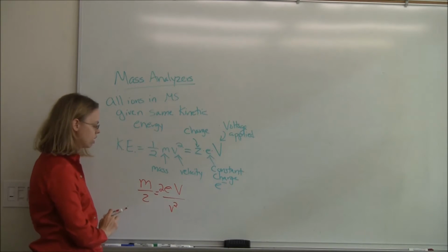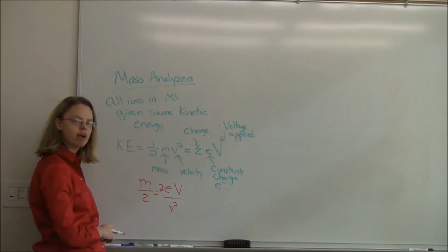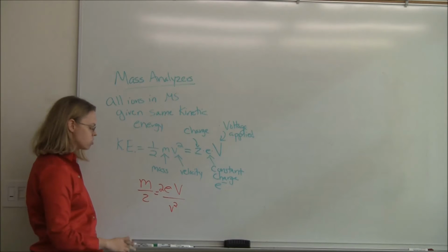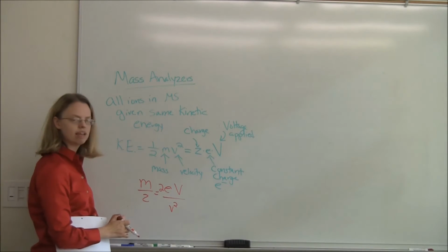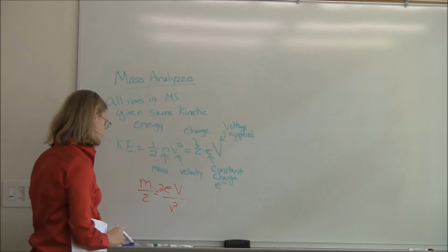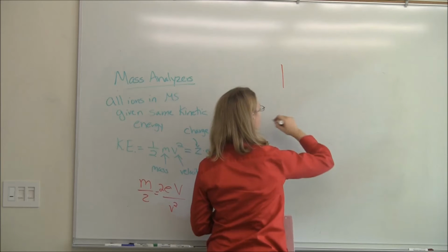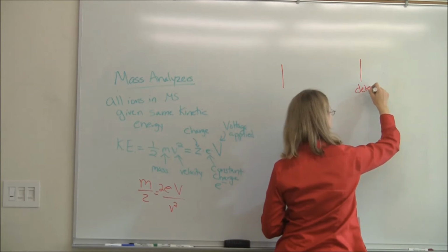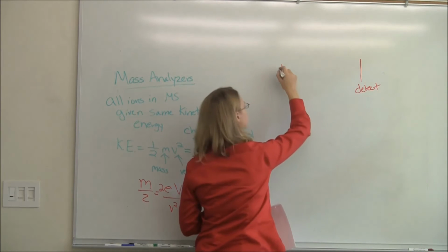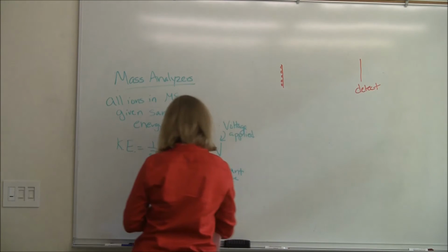So there's some ratio of the voltage that's going to affect what velocity the ion goes. If you were going to make a detector using this kinetic energy information, the detector you might come up with is this. We'll start all our ions here, and then we'll detect them here at the end. It's like a race, right? Let's see who can go first.